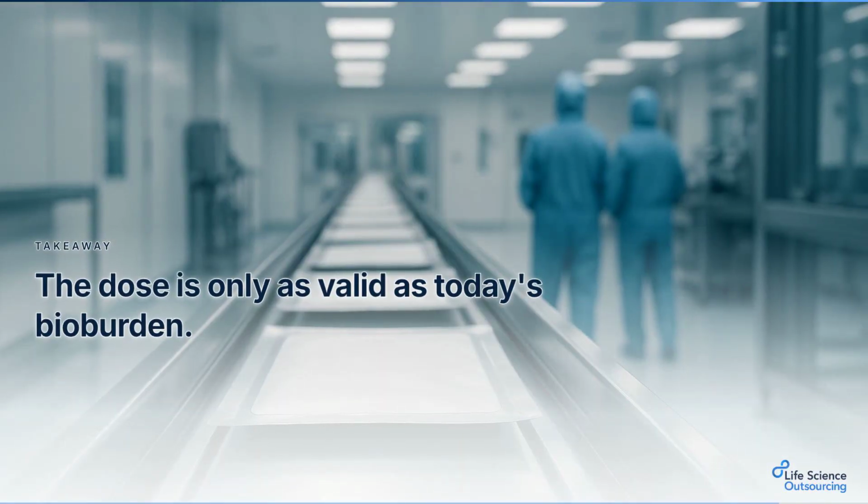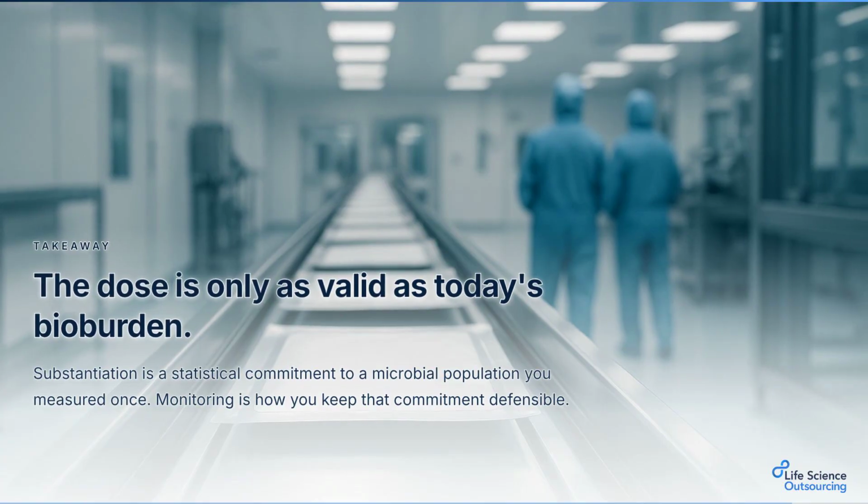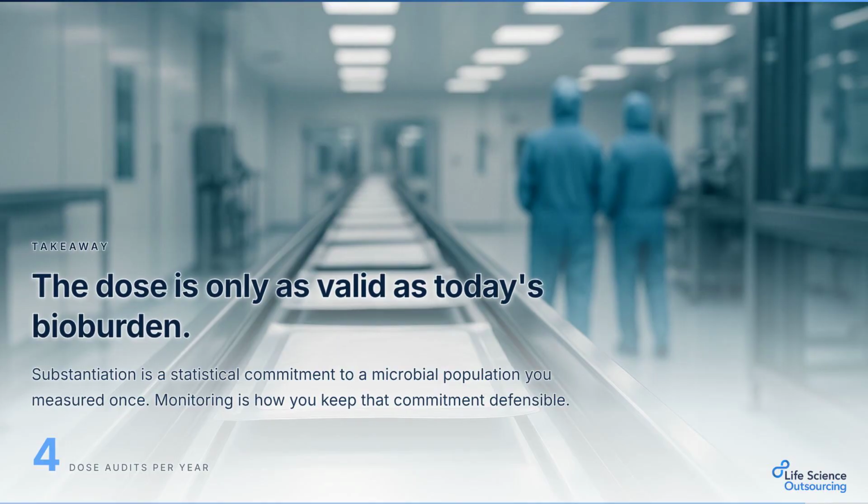Bioburden is not a lab footnote. It is the assumption your validated dose rests on, and it has to stay true every quarter, not just at validation.